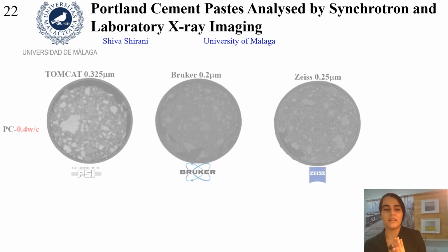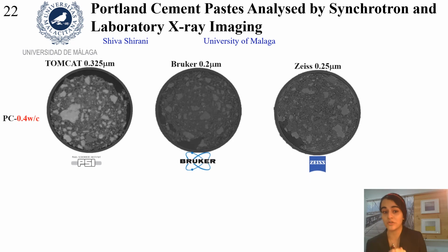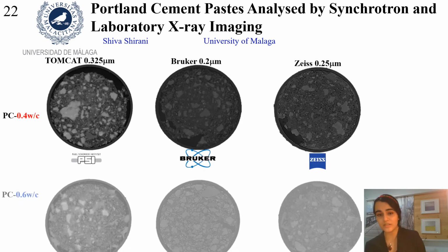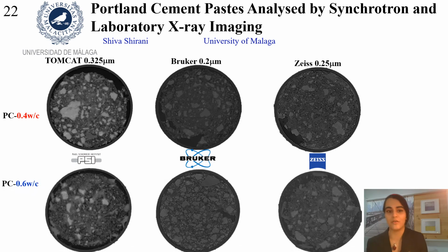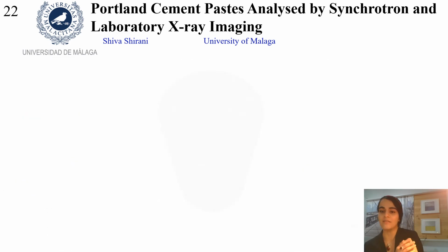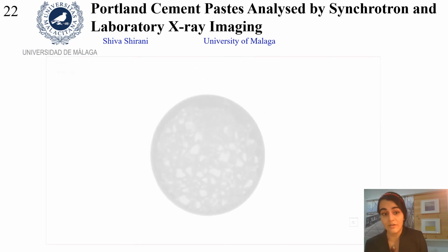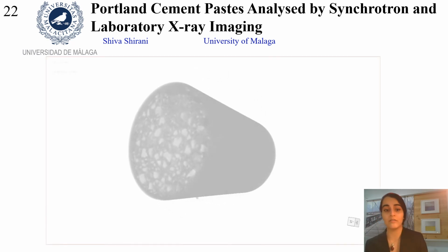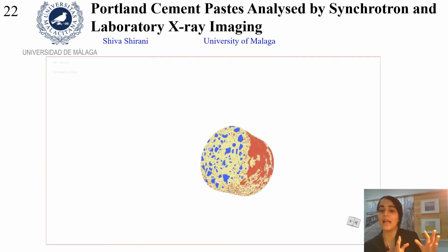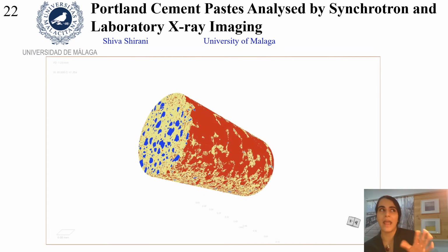Despite the around 0.2 micrometer voxel size in all the experimental setups used in this research, excellent spatial resolution and slightly better contrast with the synchrotron experiment serve as a reference and to show the limitation of the tomography approach as well. Meanwhile, the volume percentage of the constituent material phases has been in the order of 80% reacted and 20% unreacted material for both laboratory and synchrotron experiments.